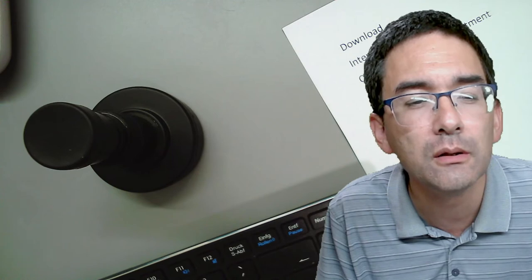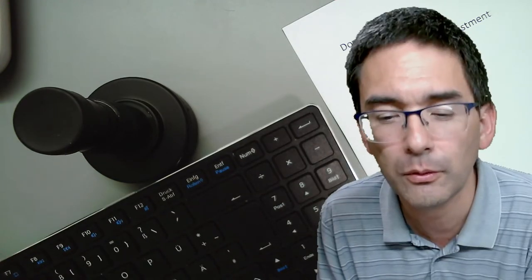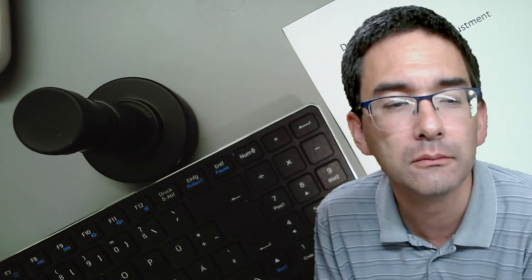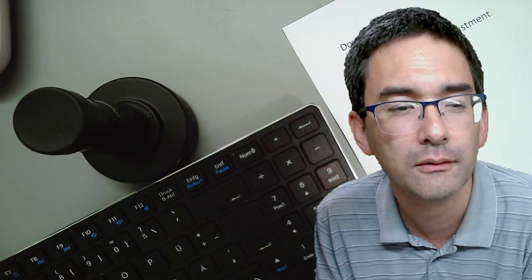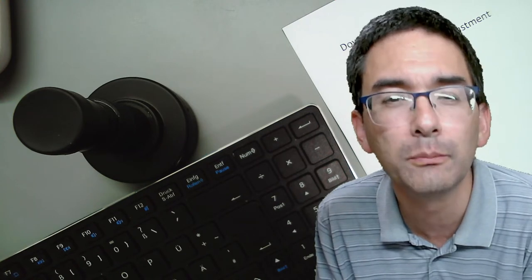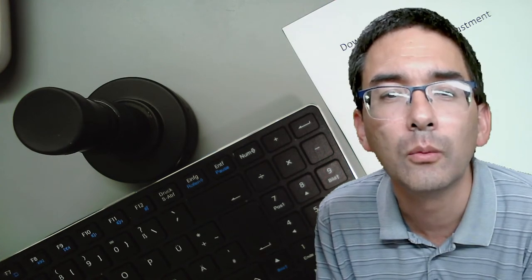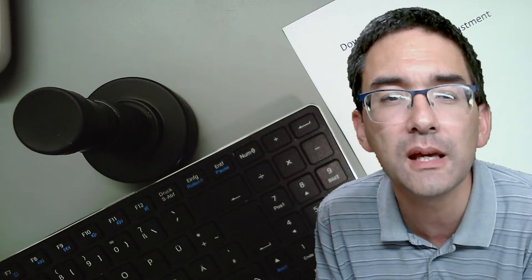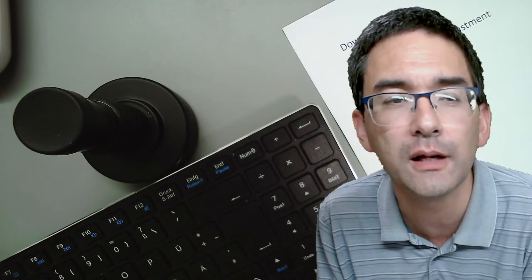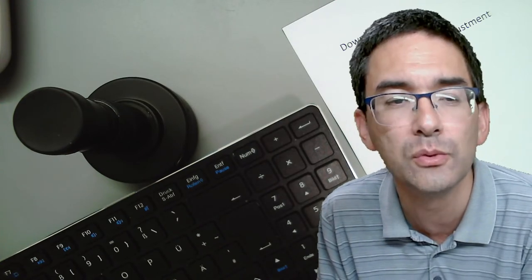I don't see the camera. It's kind of interesting. Okay, for whatever reason, my camera died on me. See, it's completely black. I'm going to close this. What I can do in this case, if this happens every now and then, I don't know why, sometimes unplugging and plugging it in again helps, because this kind of resets the USB.